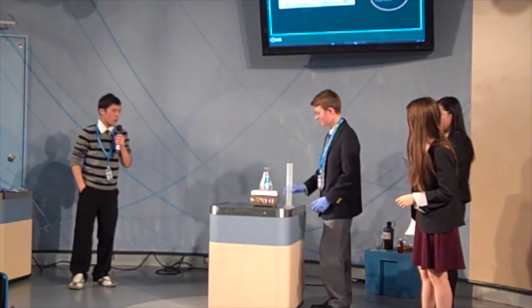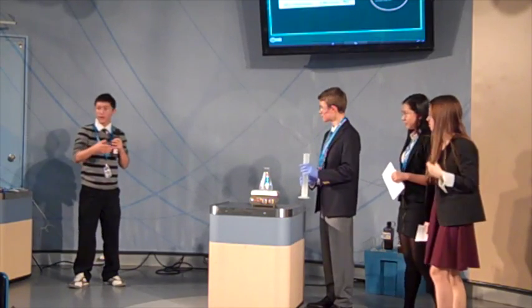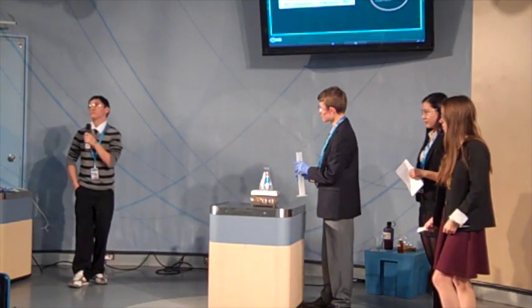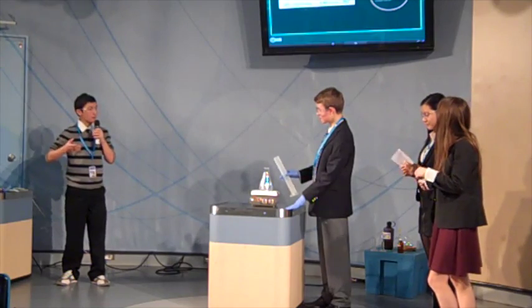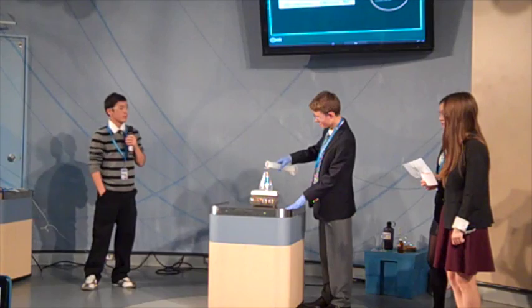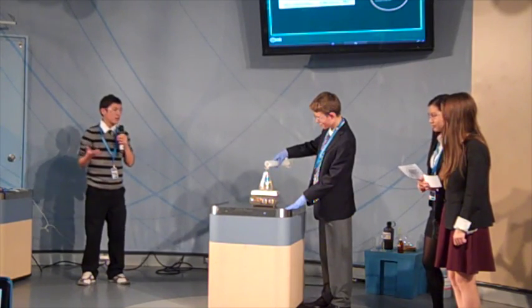Alright, so in a second you should see a reaction, and this is because of iodine and iodide ions as they change. Once Liao has poured it in, you should notice something happening right away, and this is because of the ions changing.